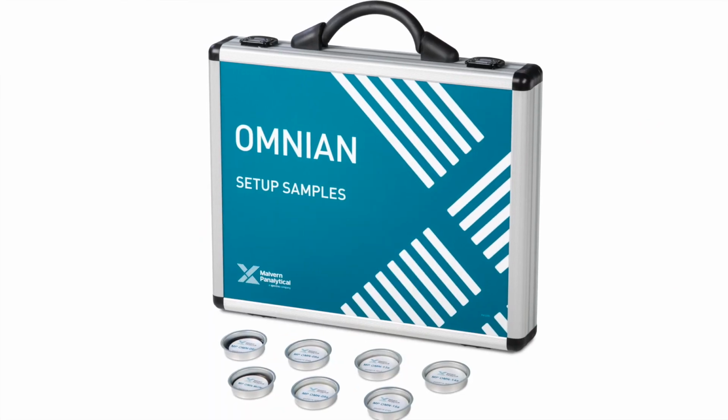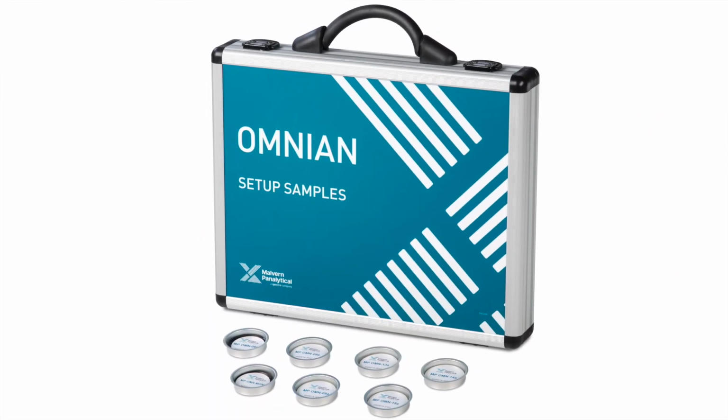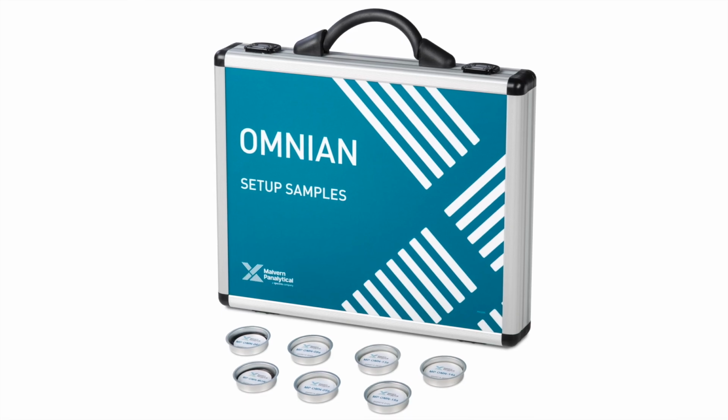And most of the time, users have their own calibrations and also Omnian as a screening tool for other samples, and both can be placed on the same instrument. So that was a little bit about the differences in setting up calibrations, conventional and screening method. That sounds really clear to me.